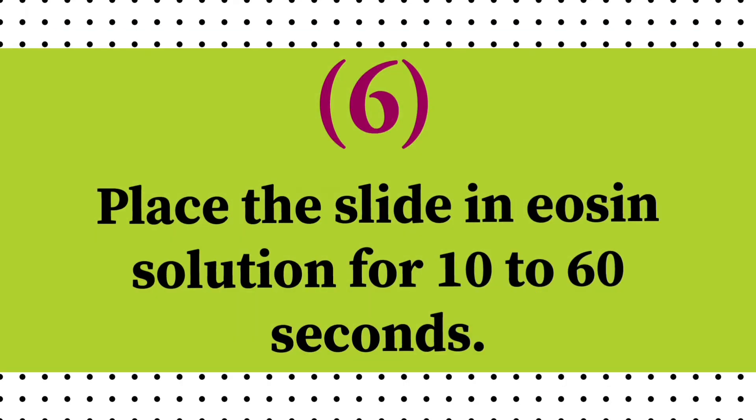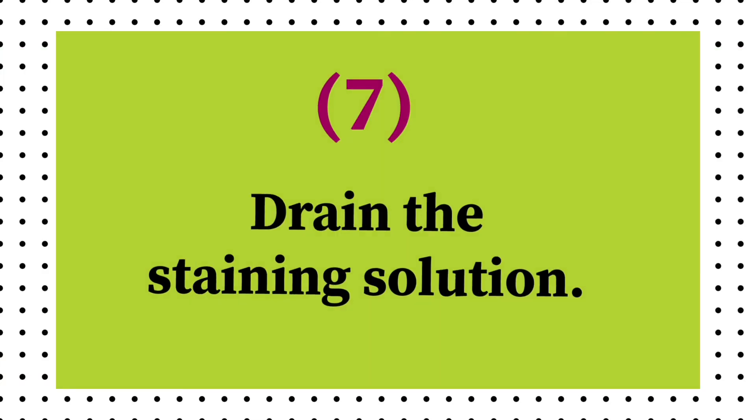Place the slide in eosin solution for 10 to 60 seconds. Drain the staining solution.